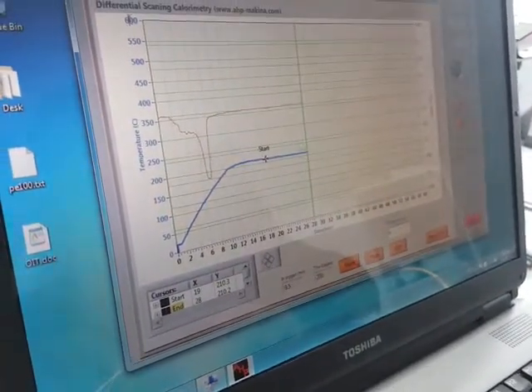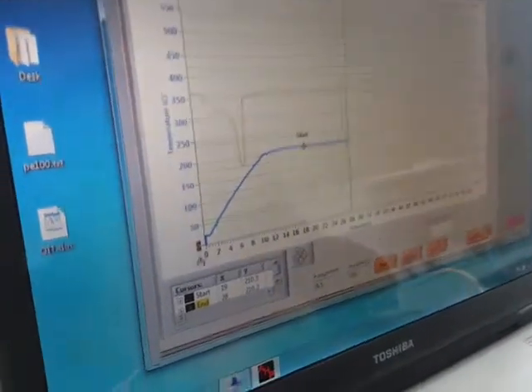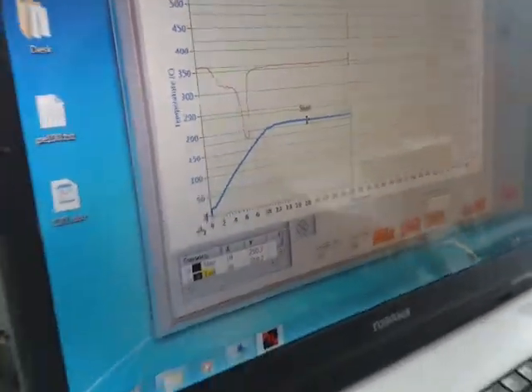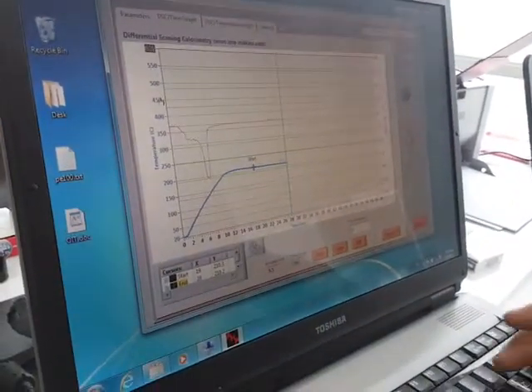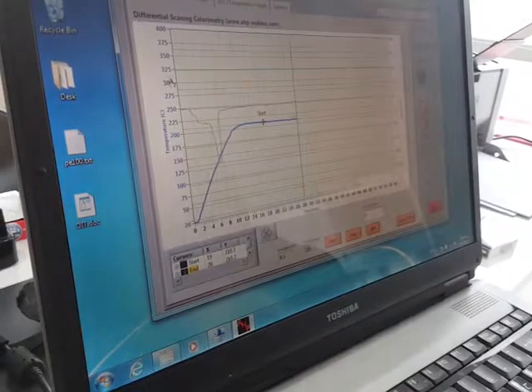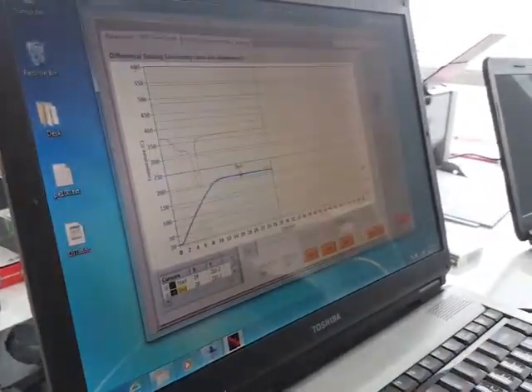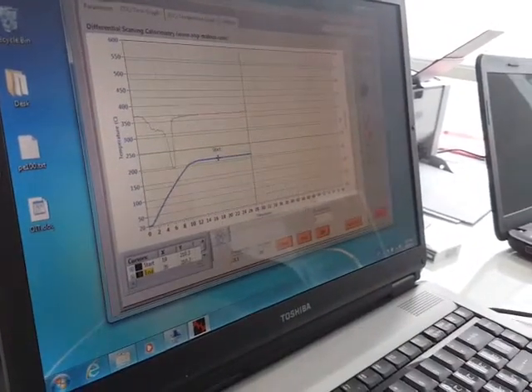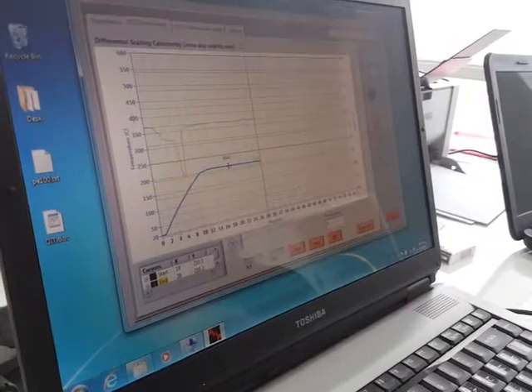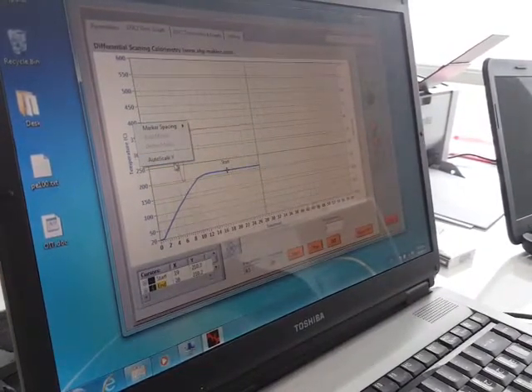Also, the operator can change the maximum and minimum level of the graph's vertical axis. You can easily change it by double clicking the range value, typing, and pressing enter. The graph is just zoomed in on the vertical axis. The operator can also easily change the vertical axis to auto scale.